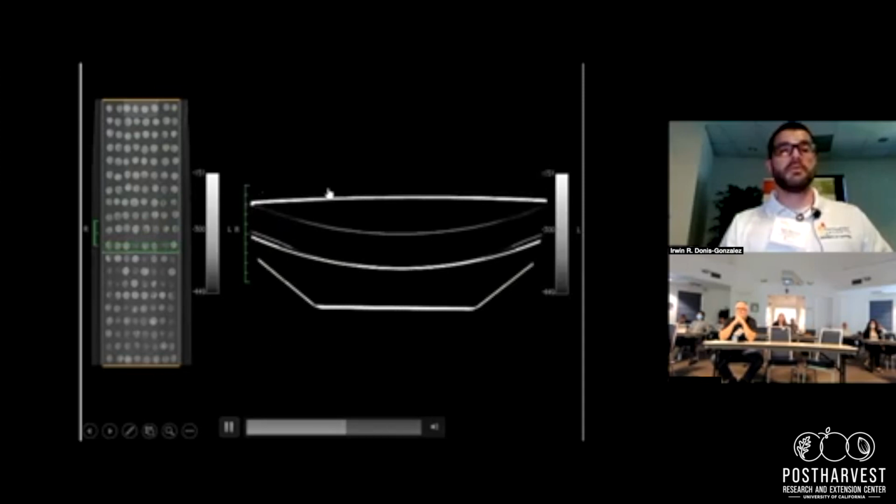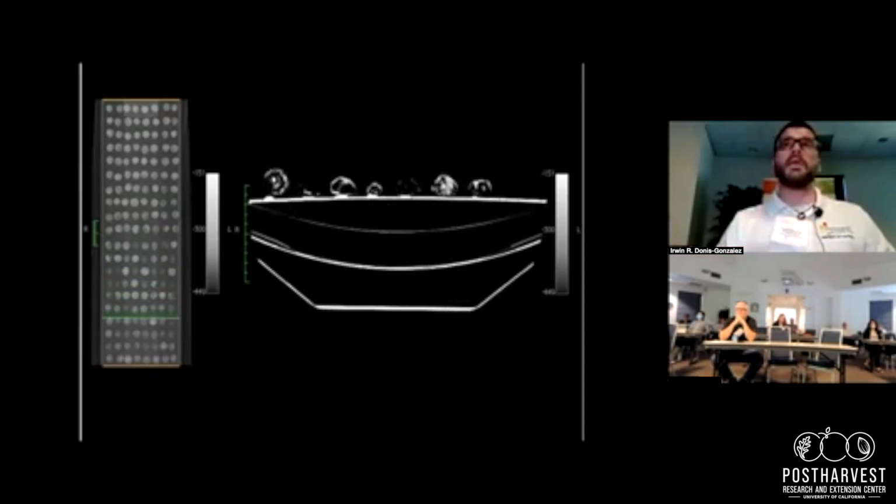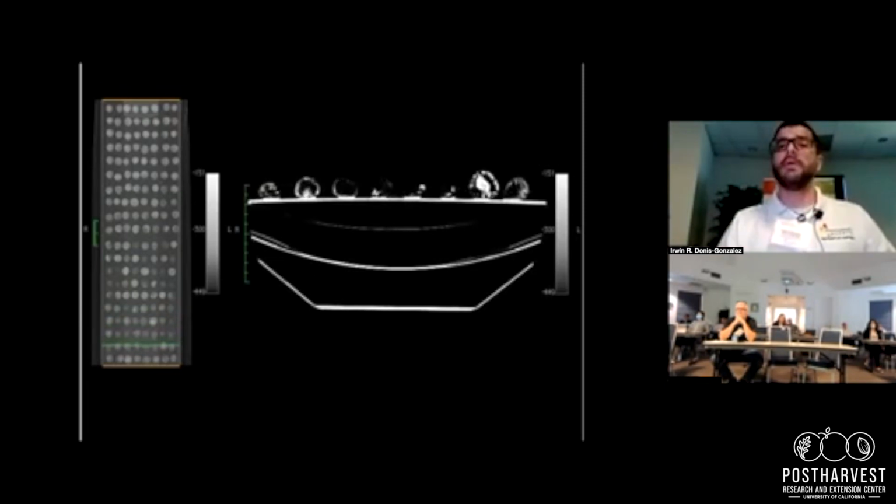Chestnuts. In parallel, I didn't even know at that point what was healthy and what wasn't, by the way. But this X-ray tomographer was just looking at the changes in density, and it was telling us what was healthy and what wasn't. We could scan this and develop calibration algorithms that would sort this out and tell us automatically which one was decayed and which one was not.